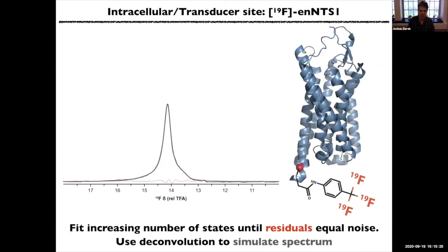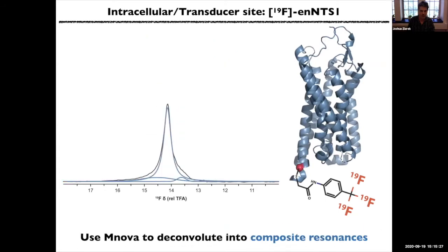Yeah, well, I think the data is definitely showing allostery, if our very basic definition of allostery is an ensemble view, for example. Looking at these spectra, this fluorine is labeled at a single site, and as we look at it, we see that there are three distinct states being populated.